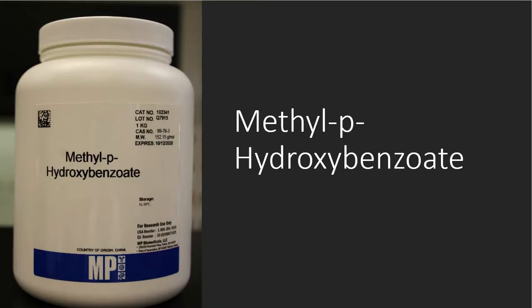All right, so this is from MP. That is the manufacturer of this chemical, and the lot number is Q7915. So there's my component for one set of laboratory data.